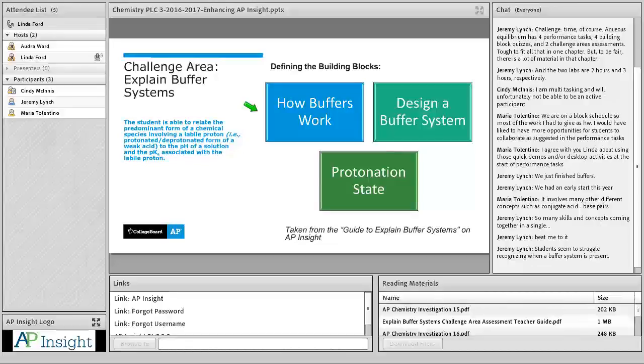So what I do is I have them make titration curves, perform these titrations for strong acid, strong base, weak acid, strong base, weak base, strong acid, and diprotic acids. I use malonic acid and maleic acid because I can get some pretty decent curves.